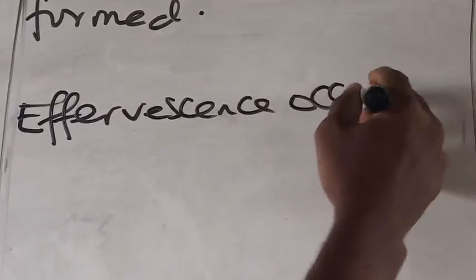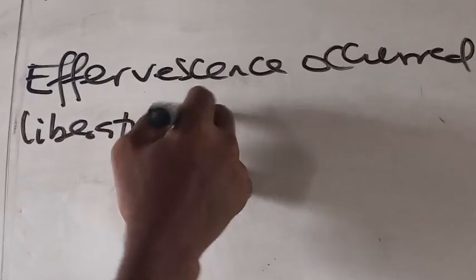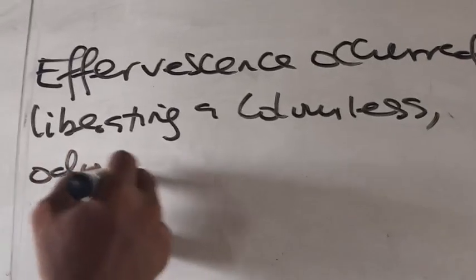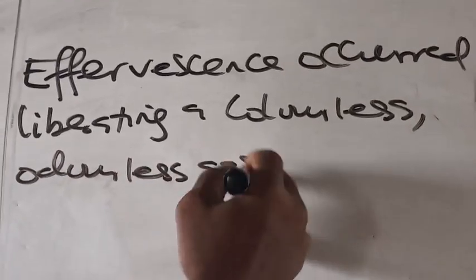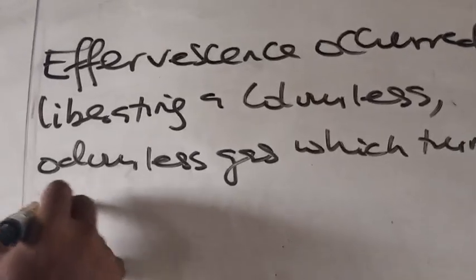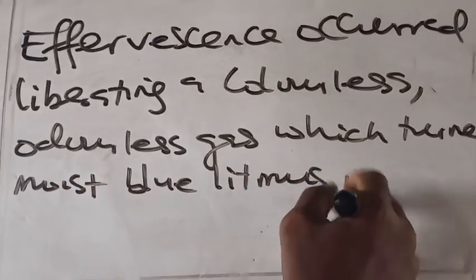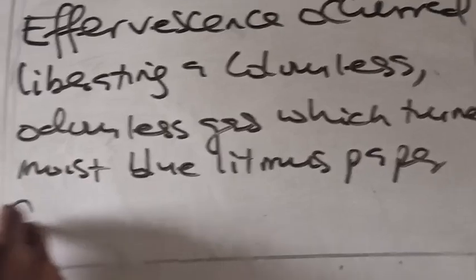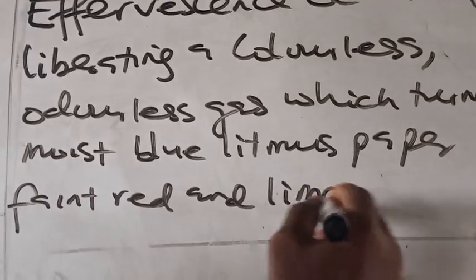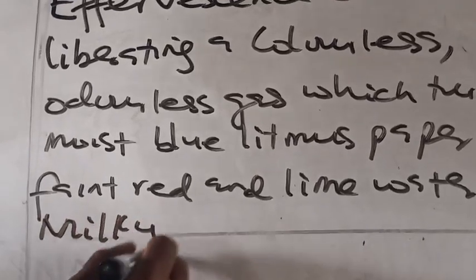Or we say liberating a colorless, odorless gas which turned moist blue litmus paper faint red and lime water milky. That's the correct observation.